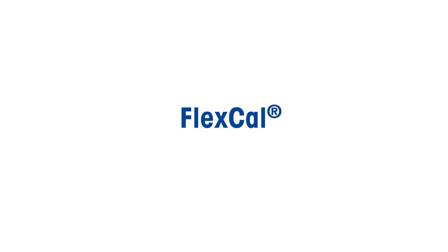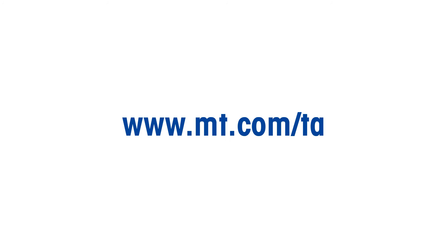FlexCal, the time-saving calibration tool from Mettler Toledo. Thank you.